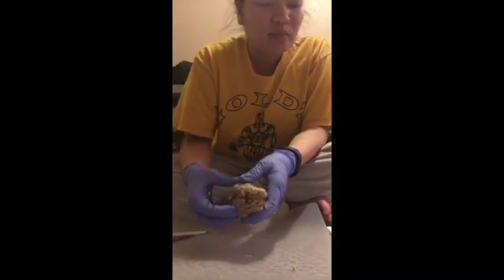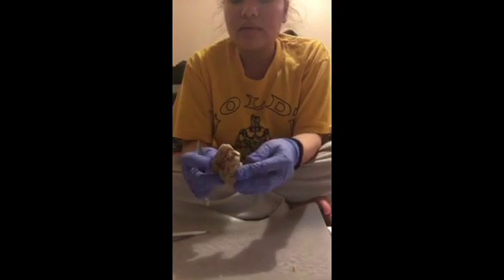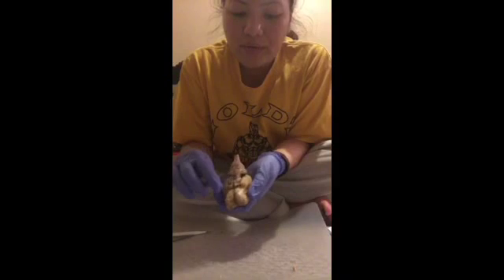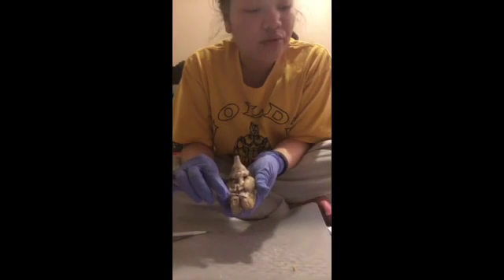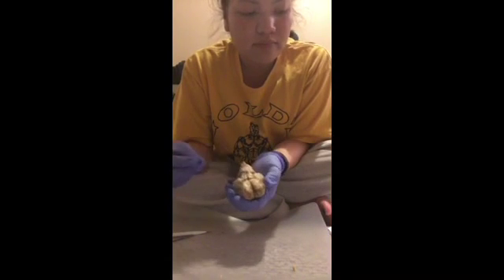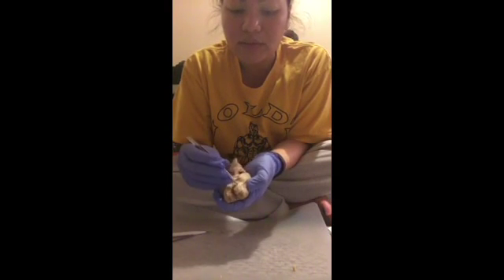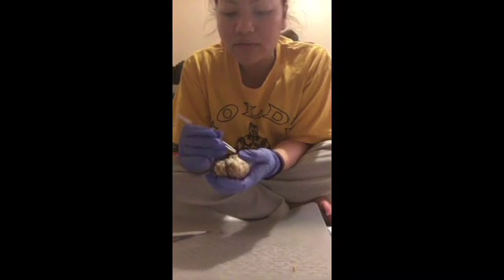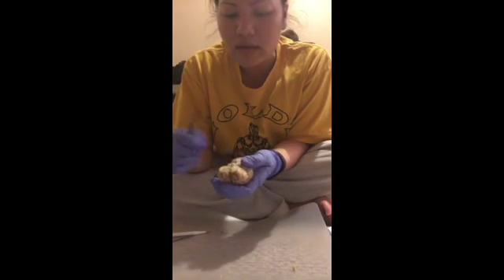And this part right here is the olfactory bulb. The olfactory tract is right here. This is the olfactory bulb, and the optic nerves are right here.